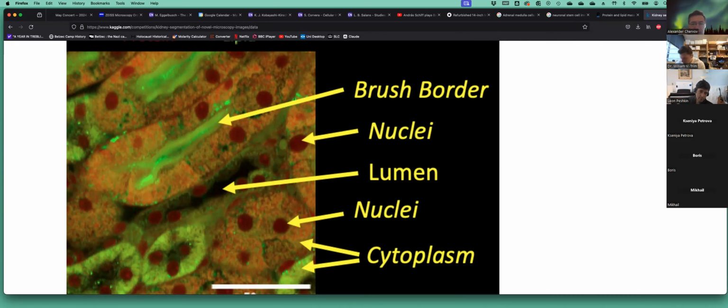Okay. Colleagues, any other questions, comments, or suggestions? So you have multimodal data. Yes. Oh, nice. Did you think about predicting one modality from another? It's clear that there's a lot of mutual information. Again, Will has demonstrated that we could separate different kinds of elements just from protein and lipid, which we did not realize before we started, and that's why we have all this additional staining. So to some extent, some modalities are going to be predictable from others. There is redundancy in all the staining.